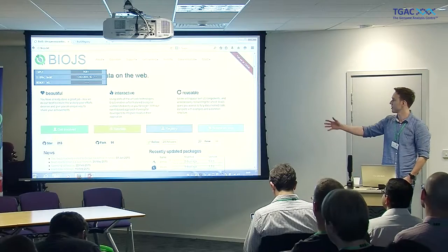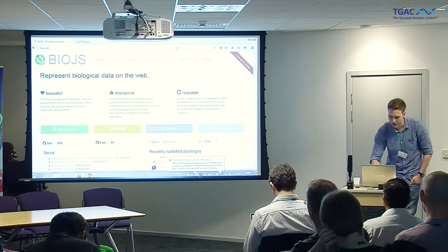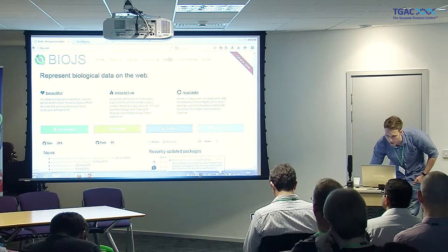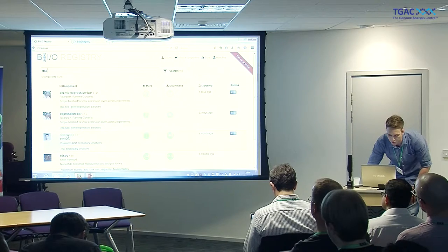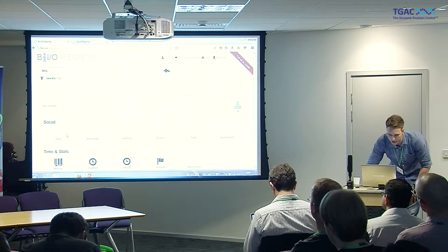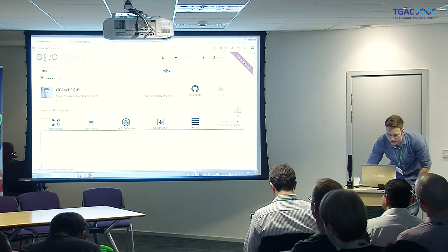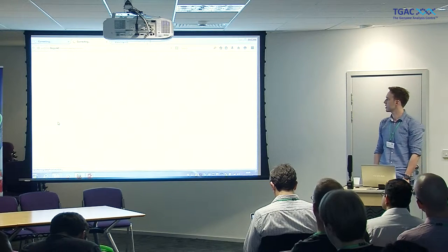DrawRNA-JS runs under the MIT Open Software License. I also have a demo, so let's see if that works. Here you can see the official bio-JS homepage, and there you can click on Registry, search for keywords — in my case that would be RNA — and there's DrawRNA-JS.